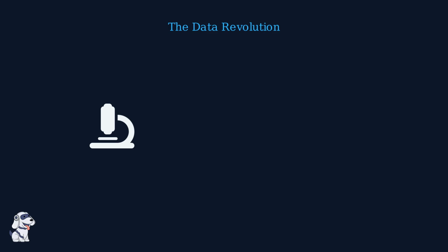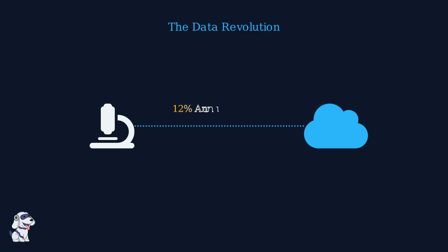Today, microscopy is undergoing a fundamental shift. We are moving from simple visual observation to a world of data-driven science. Modern diagnostic platforms are increasingly cloud-integrated, allowing high-resolution imagery to be shared and analyzed globally in real time. We are seeing a 12% year-over-year increase in the adoption of these cloud-based diagnostic platforms. This evolution transforms every captured image into actionable data, fueling the next generation of automated discovery.